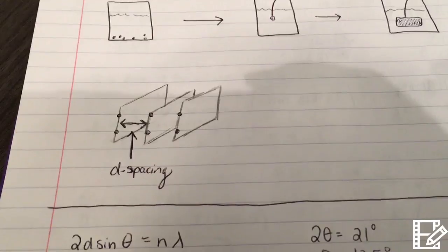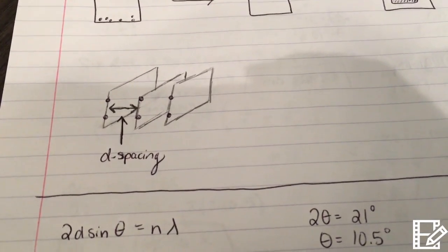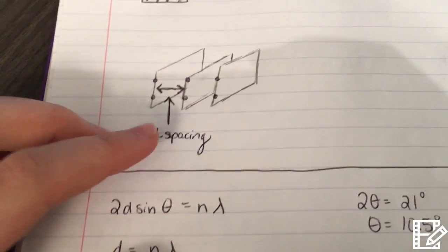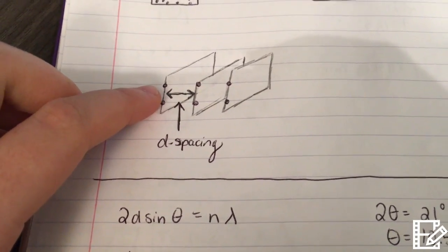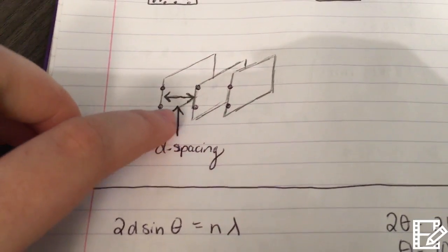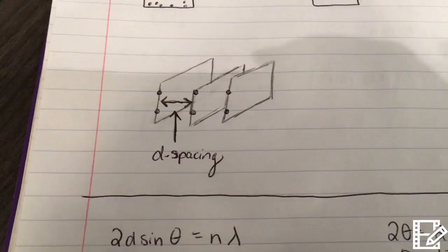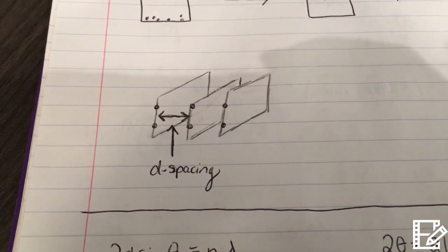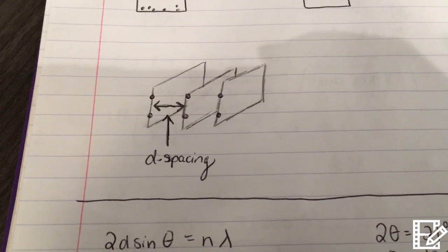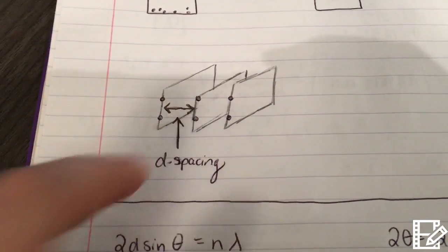Moving on, in a crystalline structure, the atoms are lined in such a way that they create many repeating parallel planes. As you can see here, the atoms are drawn as circles, and the parallelograms show the parallel planes they create. D-spacing essentially defines the amount of space between the atoms in a crystalline structure, or the amount of space between these parallel lines. D-spacing is shown here.